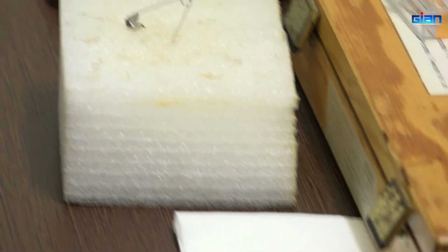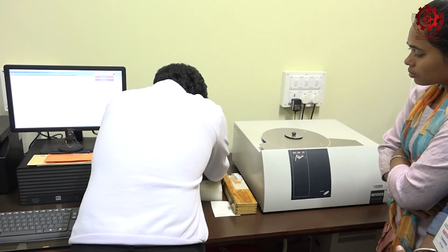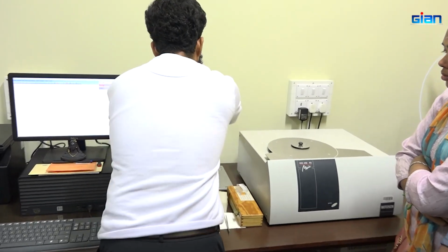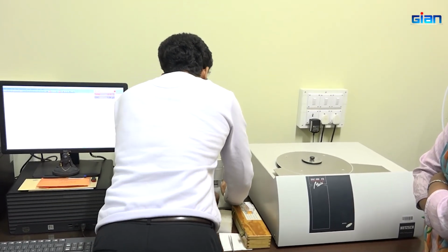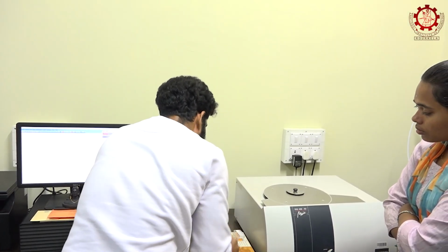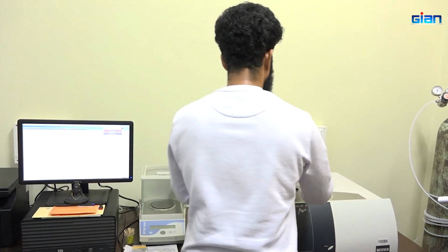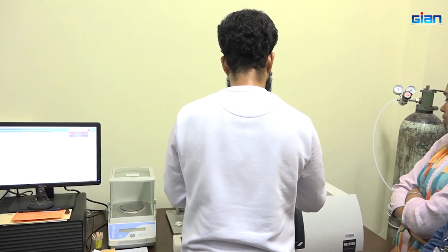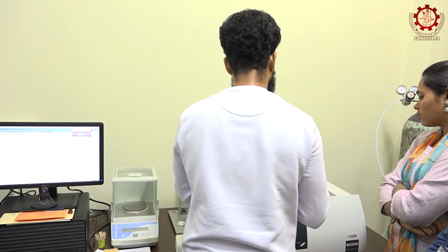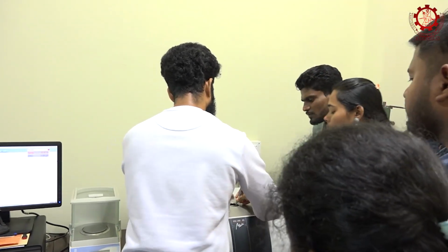And this is your hand press device. With the help of this, we will seal the pan. Now see, this is your furnace, and this slot is for your sample, and this is for your reference.